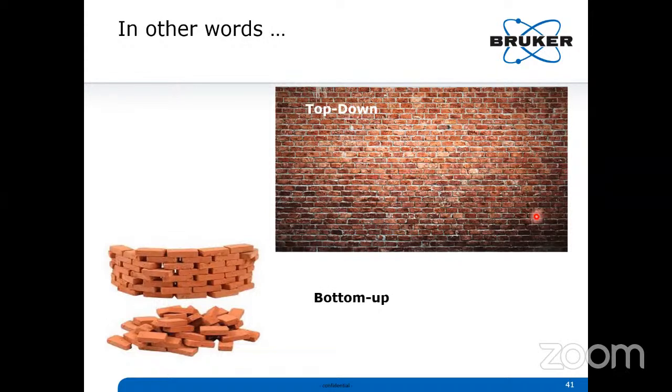When we are discussing fragmentation level, as I mentioned, A, B, C, D, E, F, G, H, both are looking 100 Daltons, but inside, the amino acids are different. The same thing will be applicable here also. 150,000, yes, it's very clear. I got the intact level 150,000. But when I ask, can you figure out what the protein is? Do any modifications happen? Any PTMs, post-translational modifications? It will be a little challenging for me at the intact level.